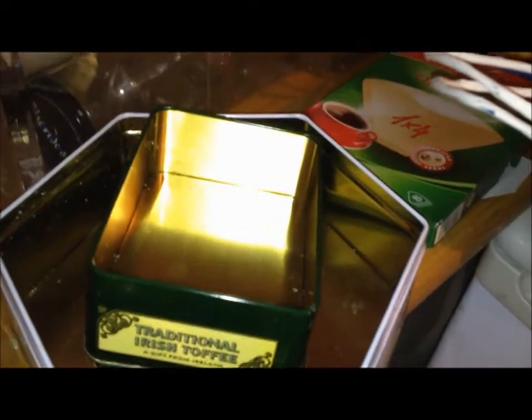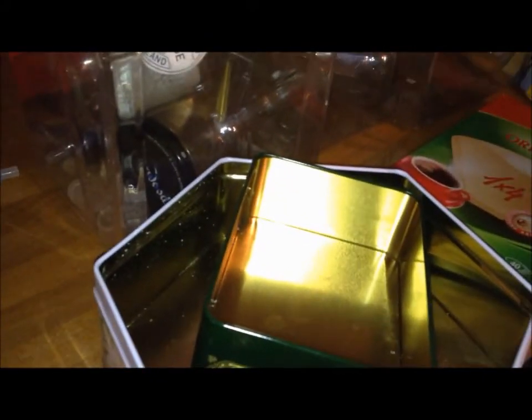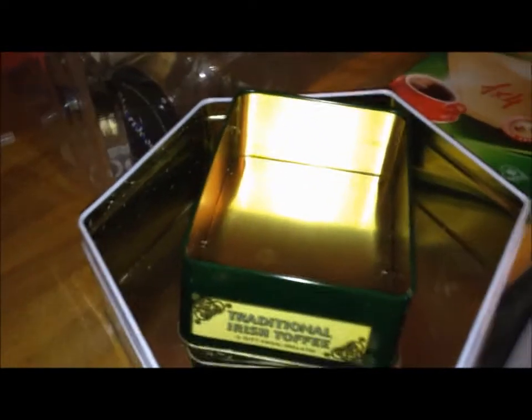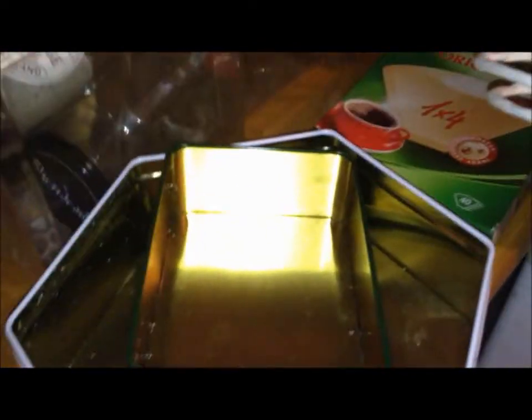And tins — I usually use them to carry things out into the garden if I'm doing an outdoor experiment, but you can also use them as a windshield, and they're actually quite effective doing that. Finally, some filter paper.